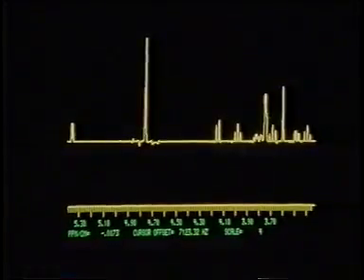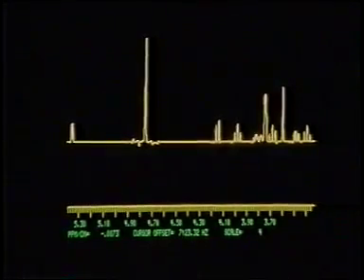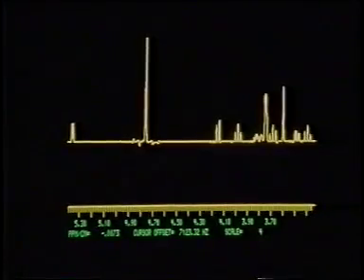If we irradiate the sample with an RF field at the frequency of the doublet's chemical shift, the protons causing the doublet resonate between their two states so rapidly that any protons that are coupled can no longer distinguish their neighbours' separate energy states. The signal due to the irradiated protons almost disappears, and signals due to previously coupled protons collapse to a simpler form as they can no longer couple with their neighbour.